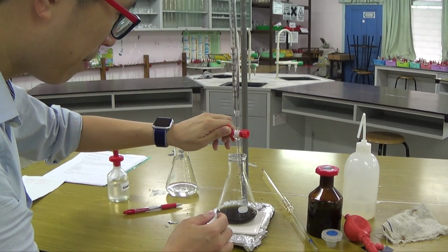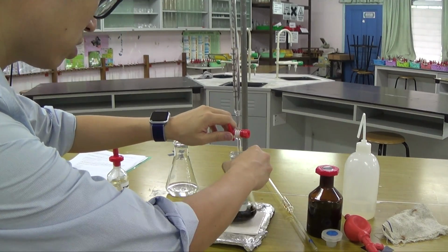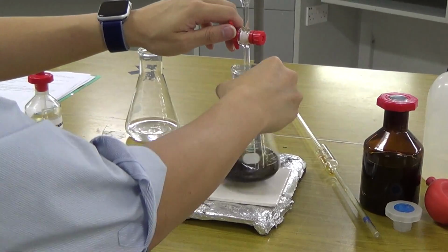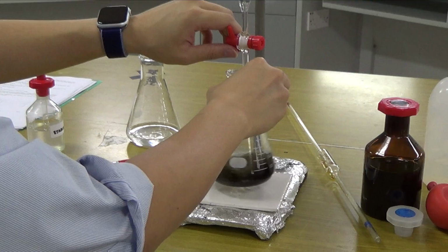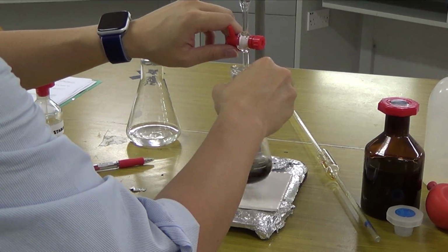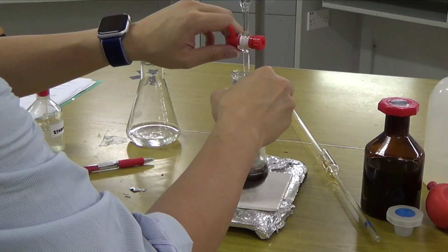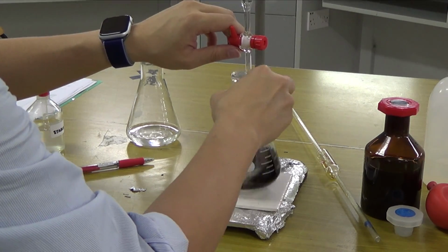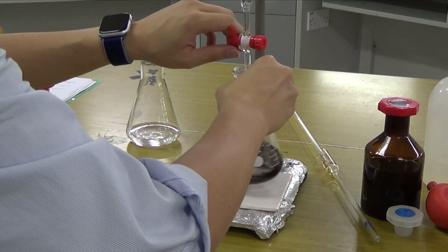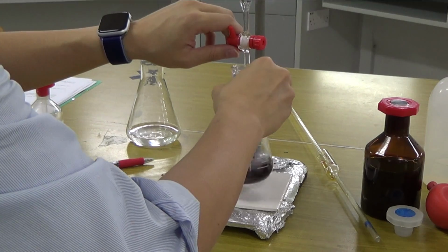Oops, my bad. Too fast. Okay, that is just right. So I hope you can see the color change there. So that is drop by drop. So my eye doesn't take away from the thing above the white tile. As soon as it changes color, then I stop. I do not care about the volume. I don't read the volume right now. I read the volume at the end point. My left hand doesn't leave the tap. As soon as it goes, one drop and then colorless, I will stop. That will be my end point.